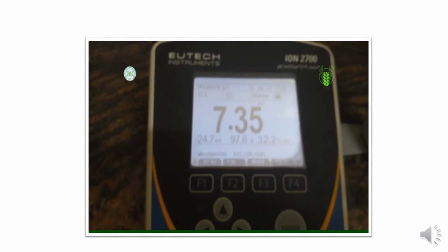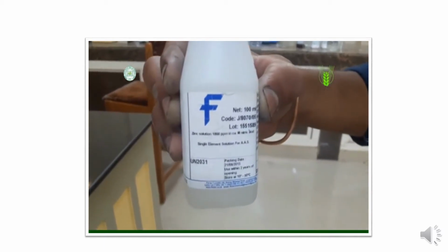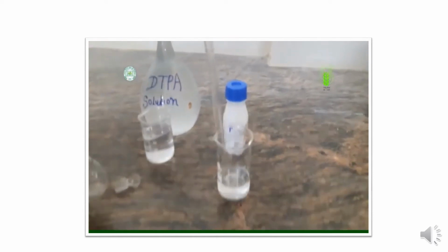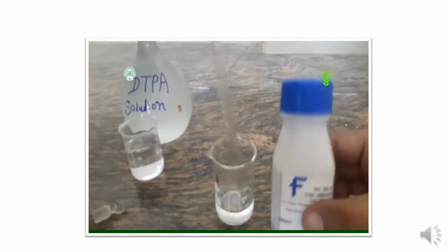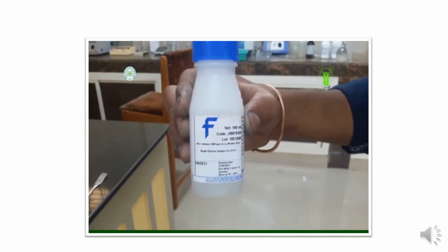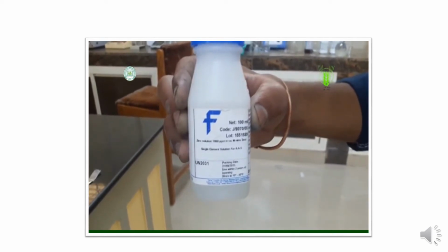We also need the pH meter because while preparing the DTPA extraction solution we need to adjust its pH. After mixing DTPA, calcium chloride, and triethanolamine, we must adjust its pH exactly to 7.3.